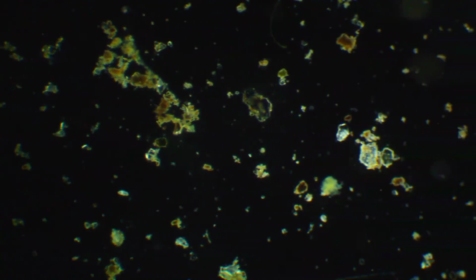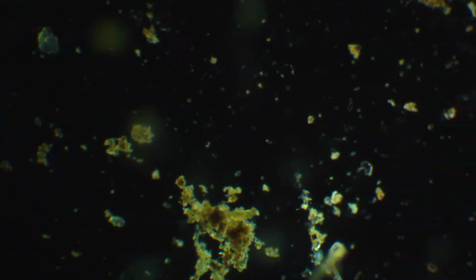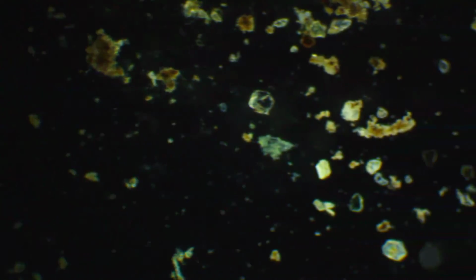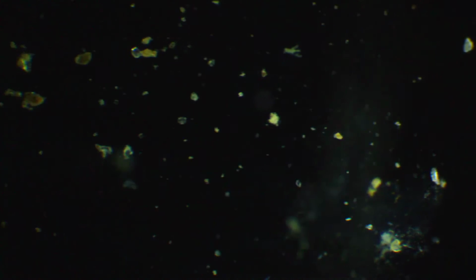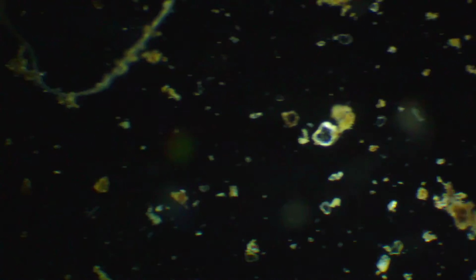I actually took not so much moss this time, it was more water, because I wanted to see... I was just trying to find some new things, so I'm taking samples from different areas of the sample, right? So there's not a lot of solid material in here compared to some other samples that I've looked at. It's a little more sparse, so we may not see some larger things.